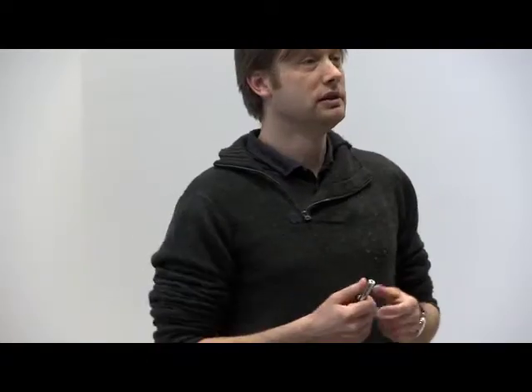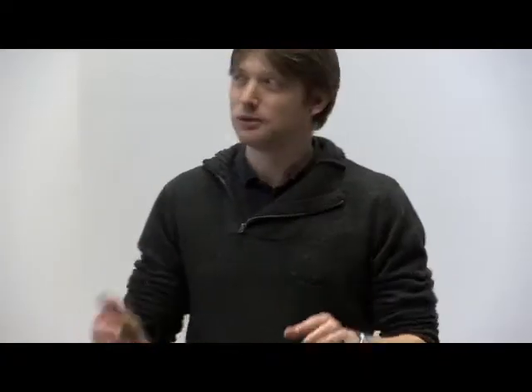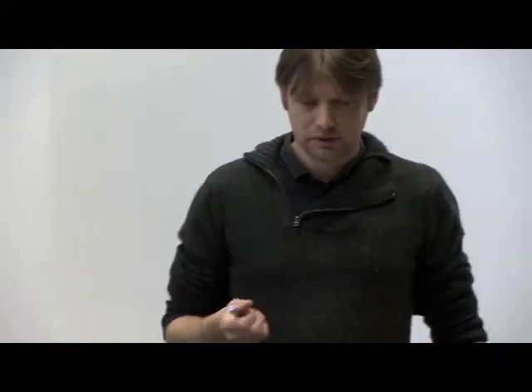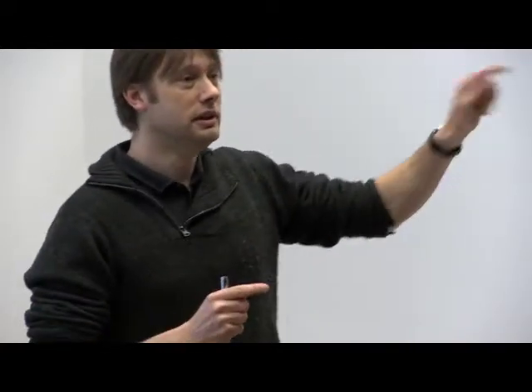I'm absolutely useless at cloning. All my people in the lab are super at cloning. So for that reason, I really like this method. And there's many other methods, but what I don't like is restriction enzymes. I once struggled a long time with a particular cloning that was in my PhD. And you know, the typical way, restriction enzyme, you cut, you ligate, and the whole lot. And after 2 weeks of trial, I was having a group meeting where I presented this. And then somebody said, well, which tube did you use? Well, the one there in the freezer. Oh, no, that one. You should use the other one in the other freezer.